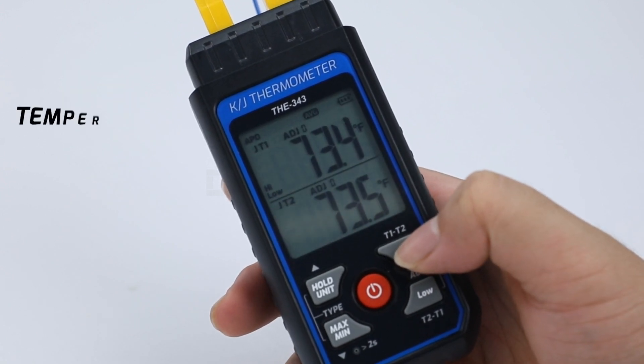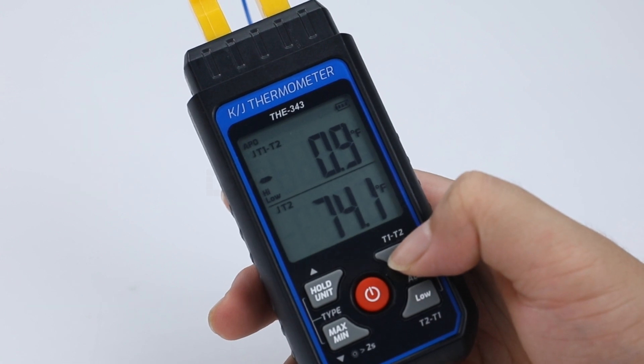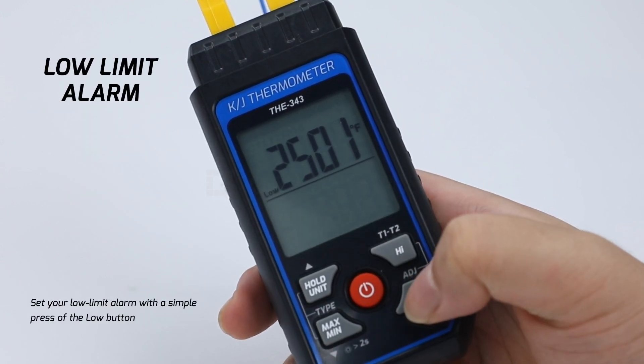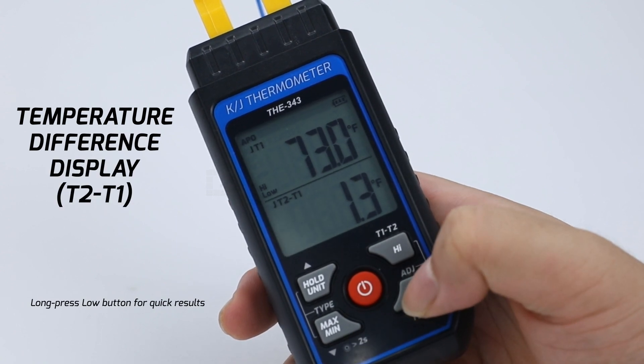Set your high limit alarm with a simple press of the high button. Long press T1-T2 for quick results to see the temperature difference between probes. Set your low limit alarm with a simple press of the low button. Long press T2-T1 for quick results to see the temperature difference between probes.